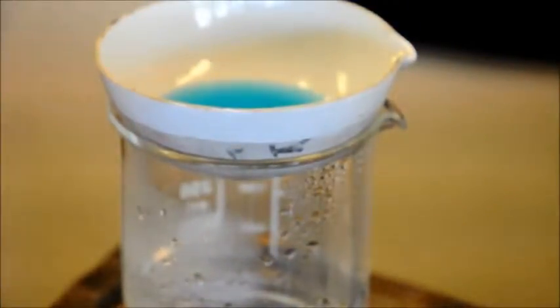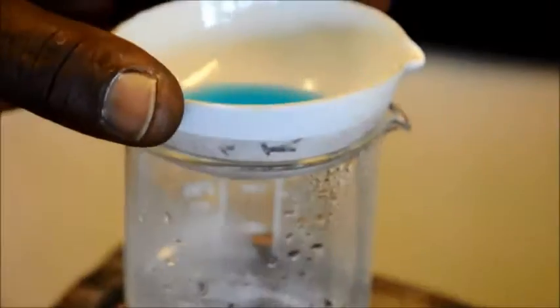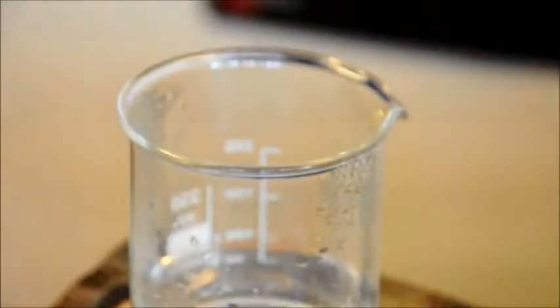There are no hard and fast rules as to how cool that must be before you can touch it. It all depends on you. You leave it until you are happy that you can touch it and safely move it to where you want to. Now the beaker will be hotter. Just a bit. I can manage that. These metal parts will be too hot even for me to touch, so I'll leave those there for a while, and whilst I move away and get the rest of the apparatus.